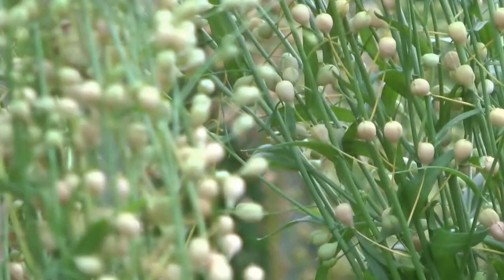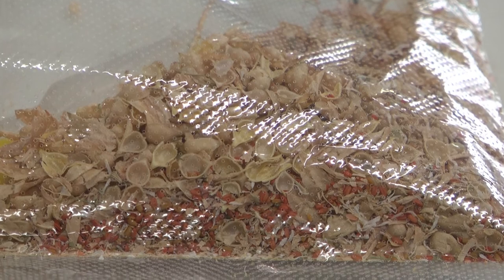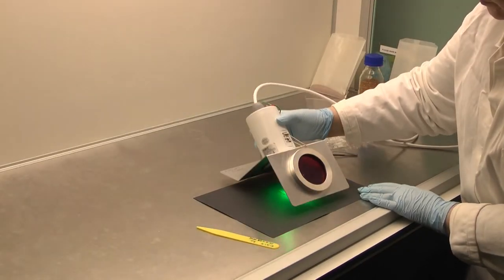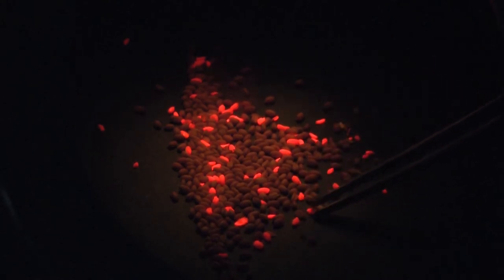Having dipped the plants in the Agrobacterium solution we let them set seed and the plants grow on in the greenhouse. When they've set seed we can identify the seeds that have been genetically engineered by looking for a red fluorescent protein that we introduced as part of our engineering.